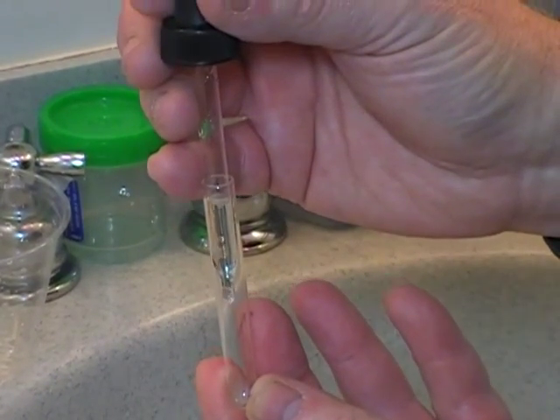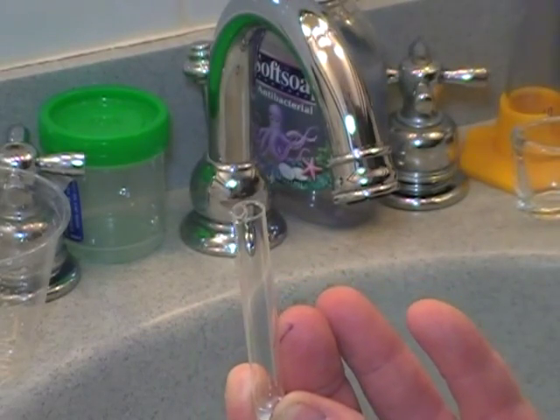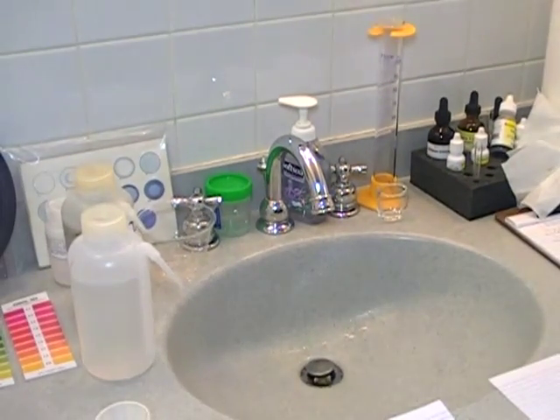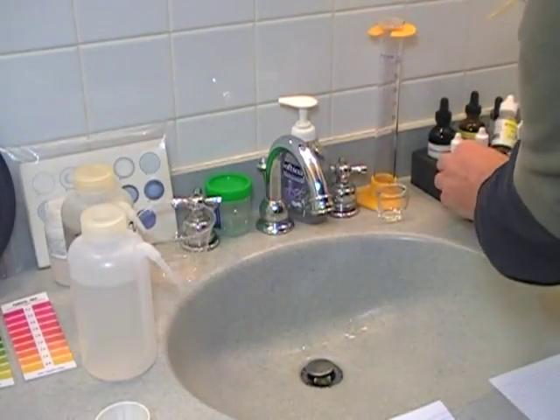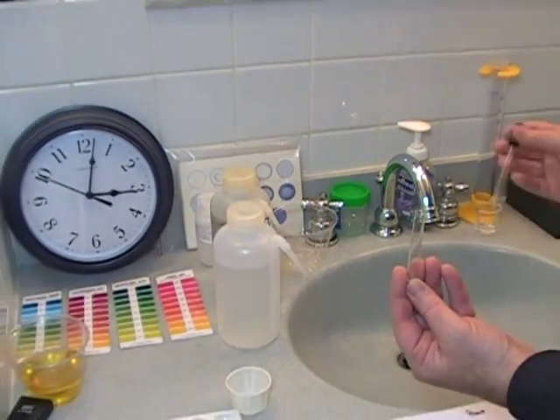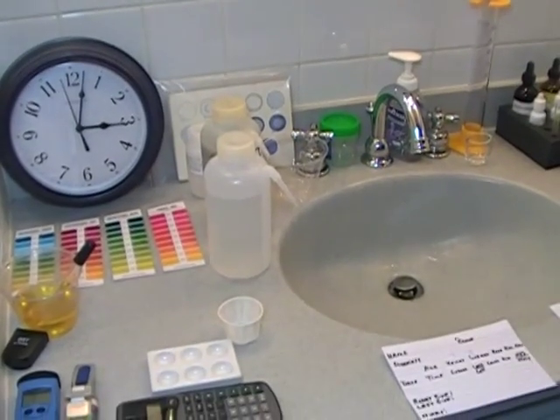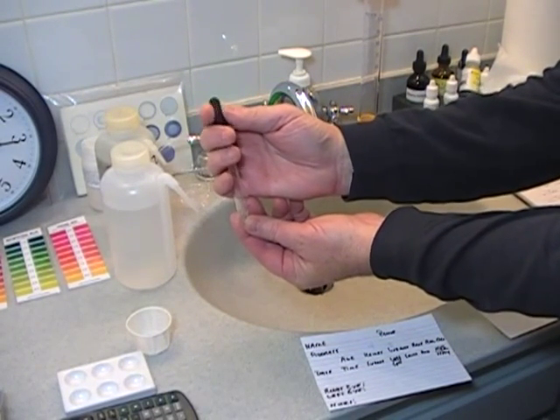Then, six drops of universal extracting solution. One drop urine. Squeeze, hold and squeeze 120 times or for one minute.